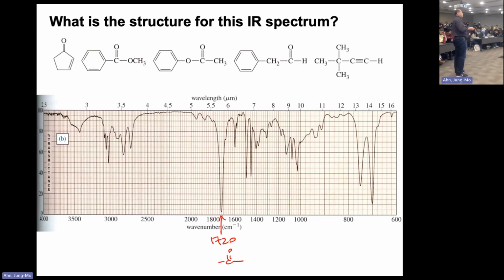What you have here is a signal right there. That's very characteristic. Normally you don't have any absorption there, but this one, that's at 2800. Once you hear that number, you should remember, oh, this might be the aldehyde, right? Along with the carbonyl signal, those are very characteristic. This one, along with this, is showing that yes, this must be the aldehyde. And then now the signals right there.